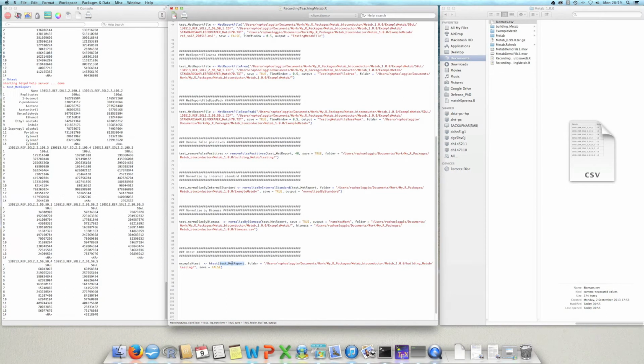So let's suppose we have a data set like this, and we want to apply a t-test or ANOVA. If you apply the function like this, it will use the default settings. The signif level will be 0.05, the data will be log transformed before the test, and the statistical test applied will be automatically chosen.